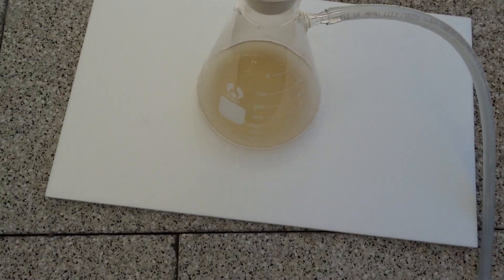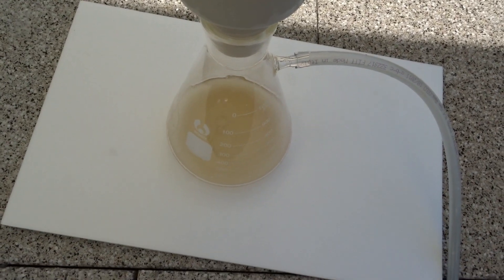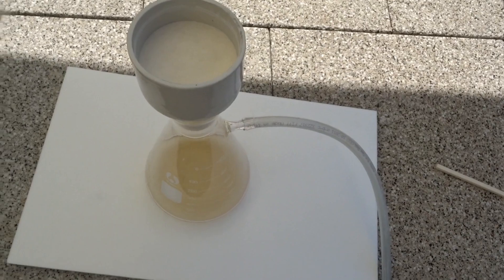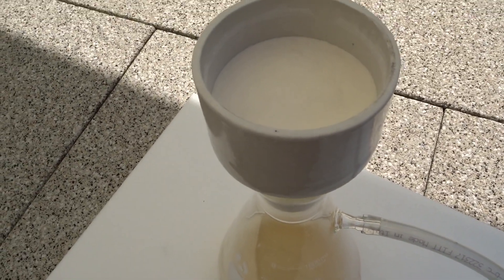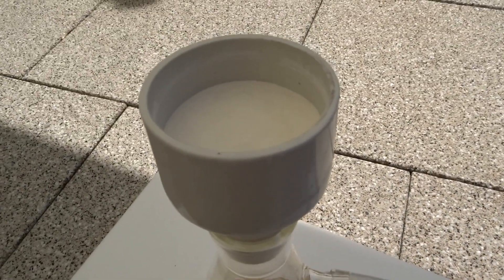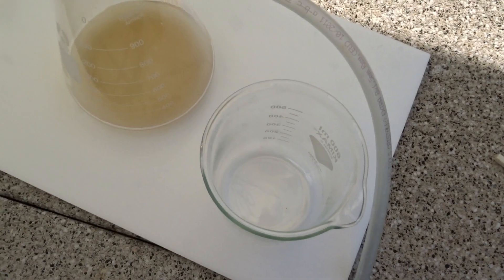I'm going to dry this and then we will redissolve it in water. The sodium teriftonate solution we worked with and got the teriftonic acid from in the last video was brown like this, and this is not how it should be.